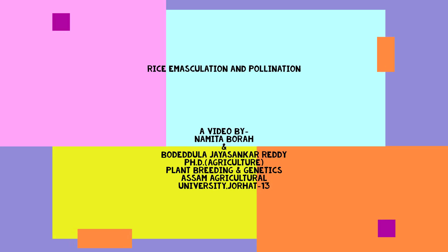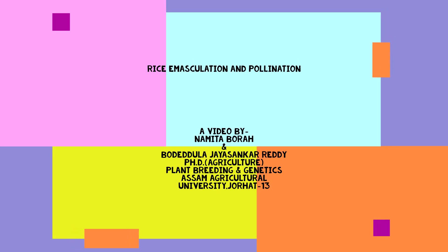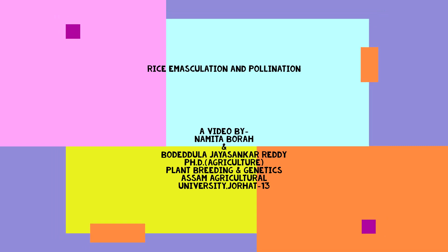Welcome everyone. Today we present you a brief demonstration on rice emasculation and pollination.